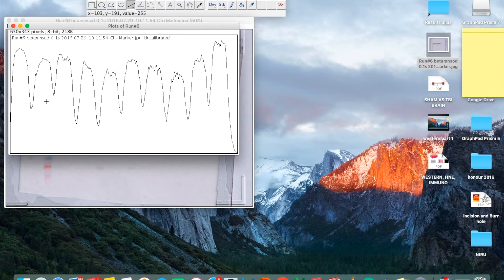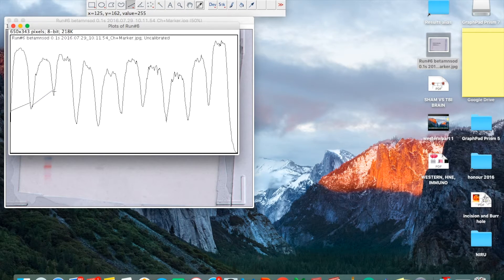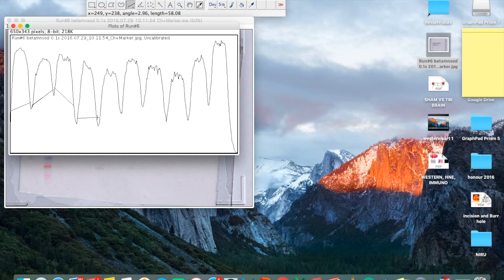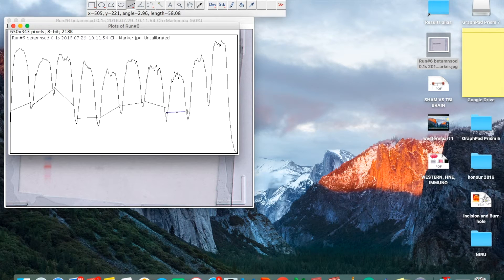There are 10 peaks. What you're going to do is select from one side to the other for each peak — that gives you the area of peak one. Similarly, select each subsequent peak area. If you do not select all of those peak areas properly, it will give you a false result. Continue selecting the area for each of the remaining peaks, going through all 10.